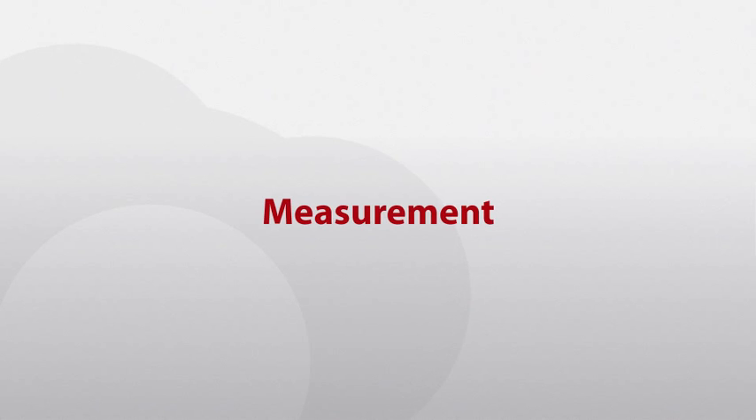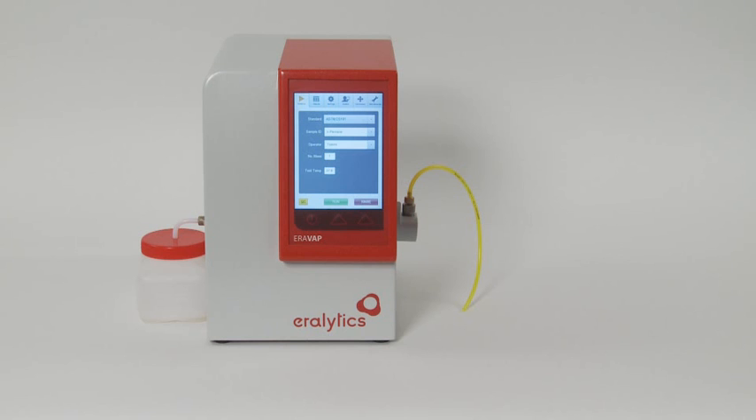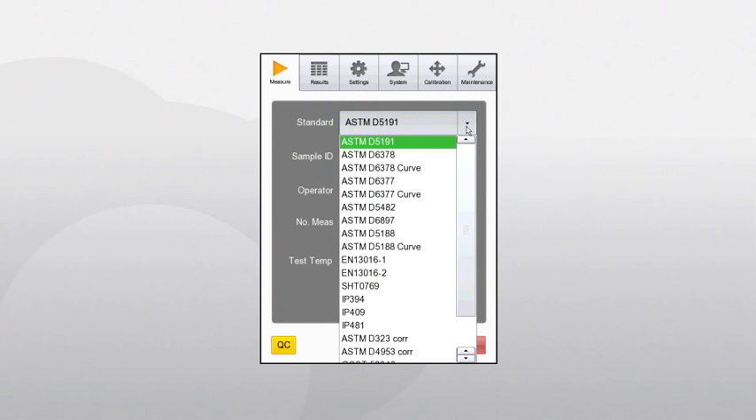Measurement. Eravap strictly follows the latest international vapor pressure methods for gasoline, crude oil and LPG. All supported standard methods are listed in the first drop-down list on the measuring screen. The standards ASTM D5191 and EN 13016, as well as the standard ASTM D5188, require a sample preparation before measurement. It is important to do this sample preparation very carefully to make sure that you get correct results for these methods.